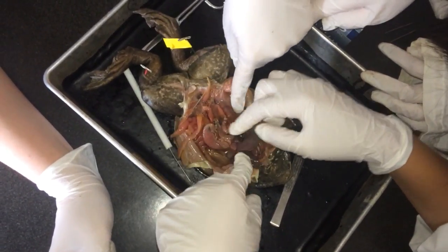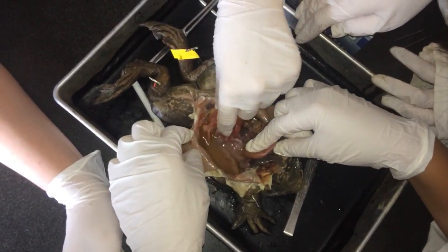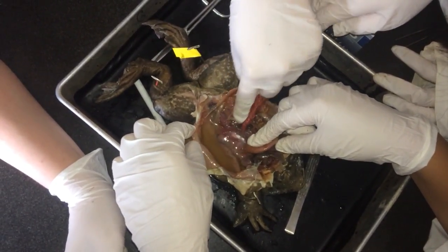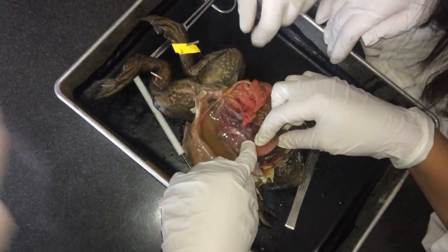I want to know if it's a male or a female, but I can't see anything. I think it is a male. Well yeah, but like where are the... where's the stuff? The testes? Is that? I don't know. Actually, yeah, I think that might be it.